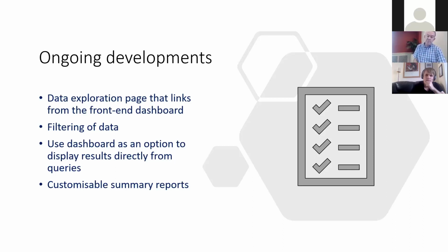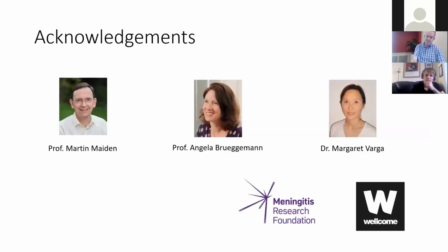And then finally, we're giving some thought to generating customizable summary reports that users will be able to set up themselves to get a quick overview of what's in the database.